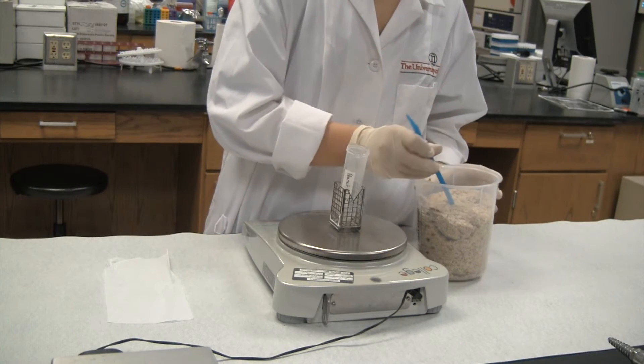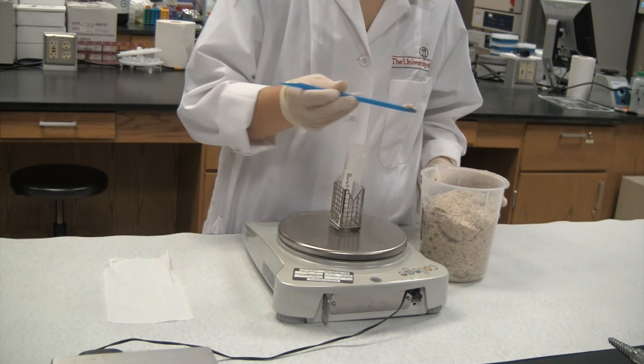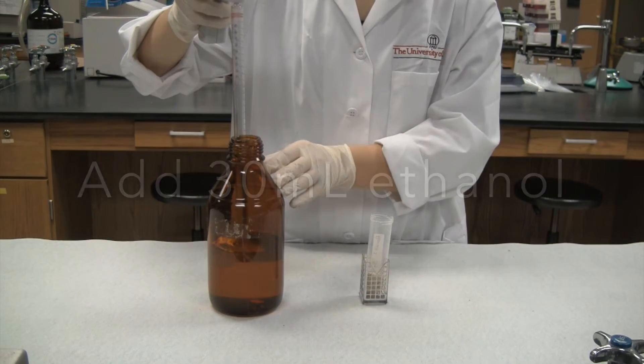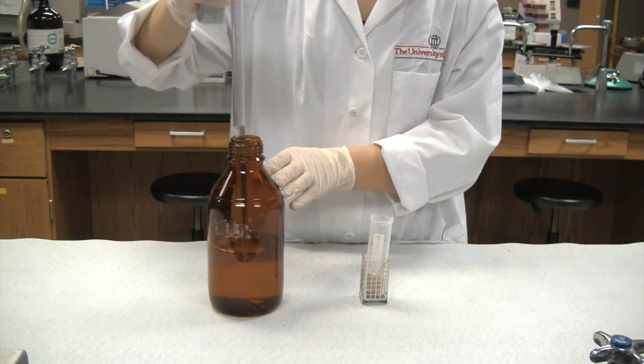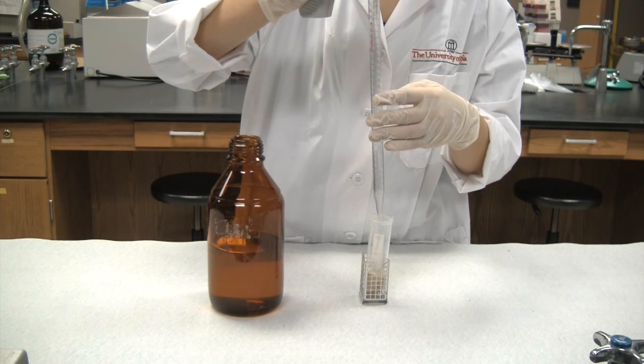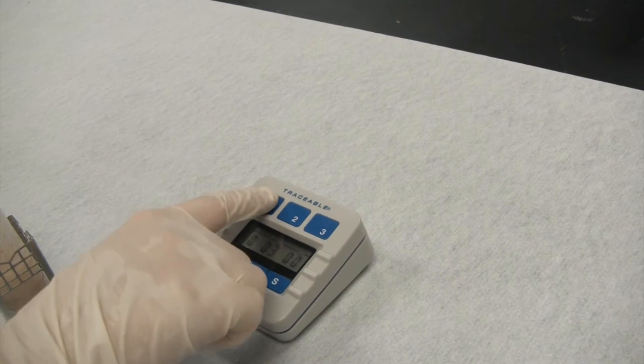From the ground material, weigh a 10 gram subsample. Next, measure 30 milliliters of a 65% ethanol solution and add this to the test portion in a jar with a sealable lid. Vigorously shake the jar with the mixture for 3 minutes.